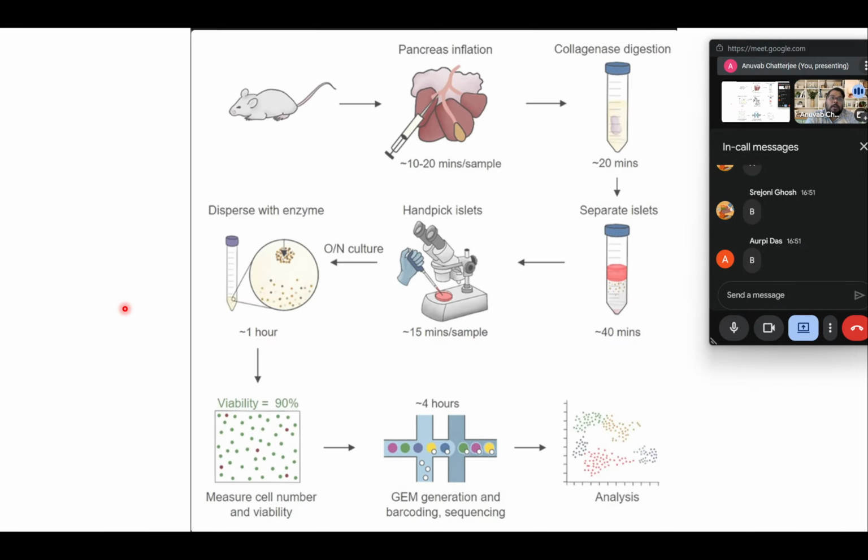If you would remember in northern blotting or southern blotting, the first step is going to be isolation of your genomic DNA or total RNA, depending on what you are trying to do. But if you are harvesting that from a tissue sample, for example, if you want to investigate the inflammation of pancreas in a mice, you would first have to take the tissue out of the mice, and then you will have to digest the entire tissue.